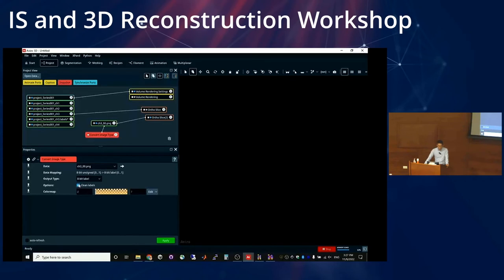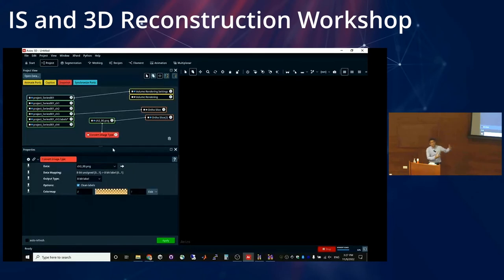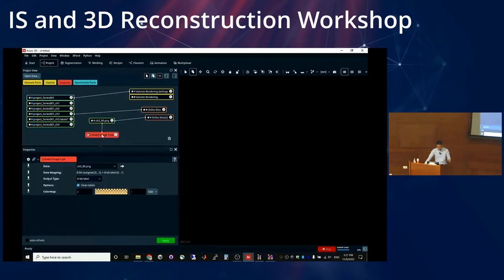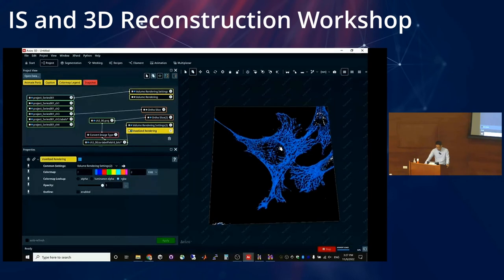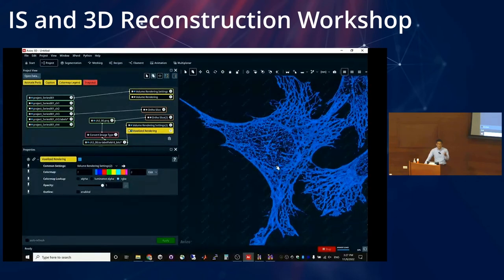And then, clean labels, if you check this, it will subtract 1 from the values here. Because it depends on the segmentation tool that you use outside of Avizo. They might interpret 0 or the values differently. So in our case, I think 0 was assigned to the outside and 1 was assigned to the fiber, so I will not do that. Yeah, so now you have your label field. And if you do a voxelized rendering, okay, so this is my result from Ilastik, okay?